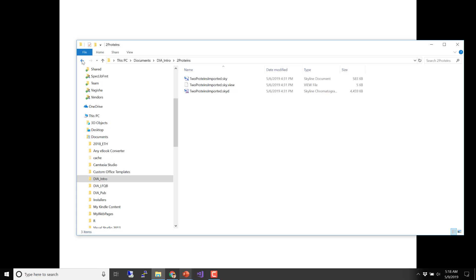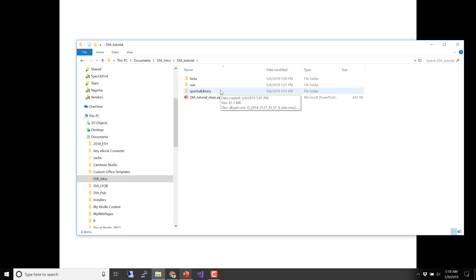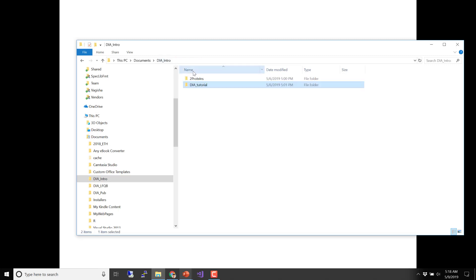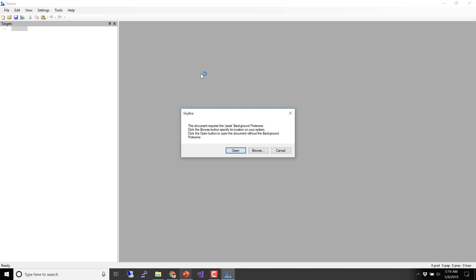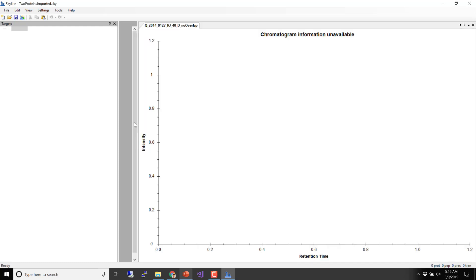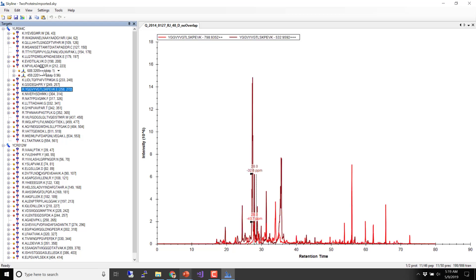Let's get to the demo. We're going to be looking at data in the DIA intro folder — there's a two-proteins dataset that Brian Searle showed yesterday, but we're going on to the DIA tutorial. We're going to start from scratch. Click New Document, and just to get everybody on the same page, go to Settings Default and say no, I don't want to save my current settings. Now we should all have the same baseline document.